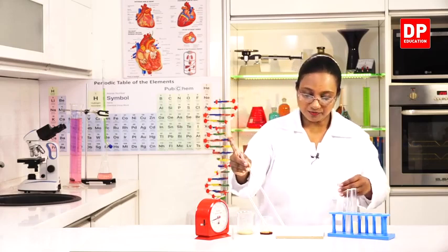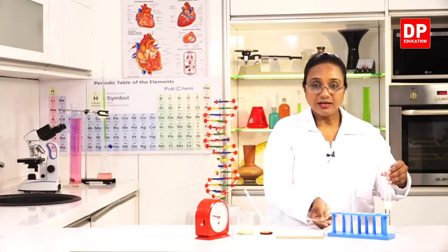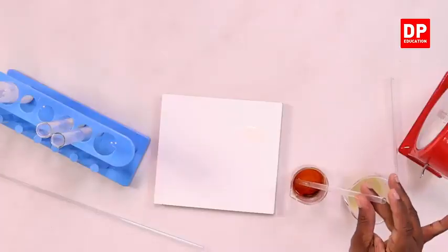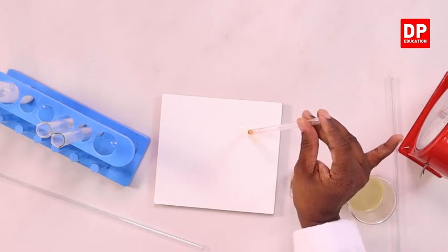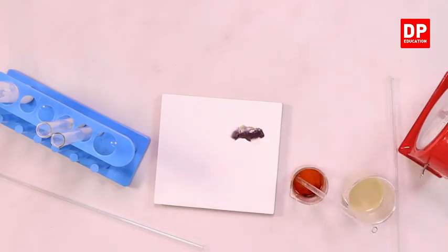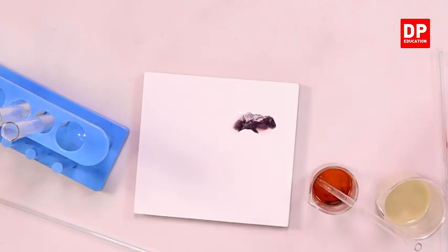I take a drop of the starch solution so that you can again look at the color change. To this, I will add a drop of iodine. Now, you can see it is a very dark blue color, almost blackish blue. This is only for our reference purpose.